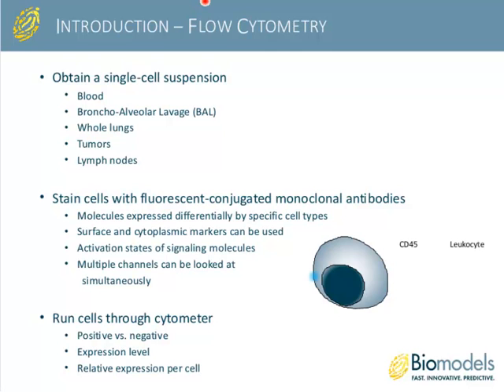The first three markers to identify a Th cell will be CD45, CD3, and CD4. And then from there, we can look at intracellular markers, FOXP3, that's a transcription factor that is expressed in Tregs. And then if we wanted to see antigen specificity through the TCR, we could look at the phosphorylated version of ZAP70, which is a signaling molecule attached to the TCR. And then we can look at intracellular cytokines, such as IL-10, which is a Treg effector cytokine inducing immunosuppression.